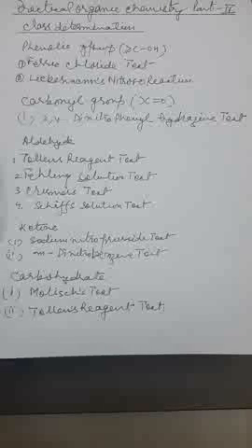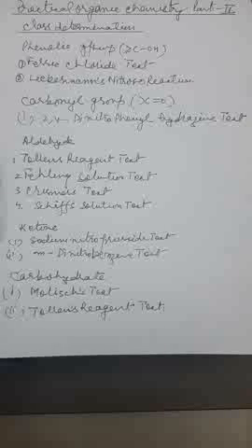So this is all about carbohydrate, ketone, aldehyde, carbonyl groups and phenolic groups for class determination.